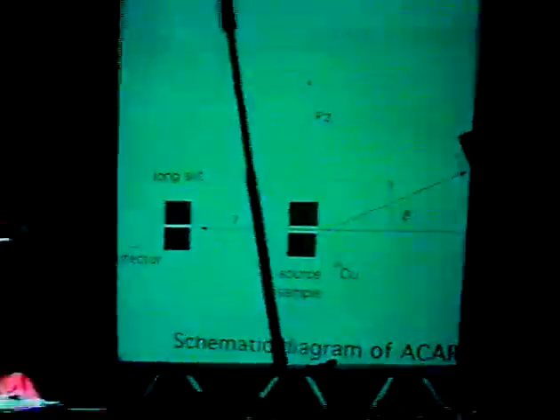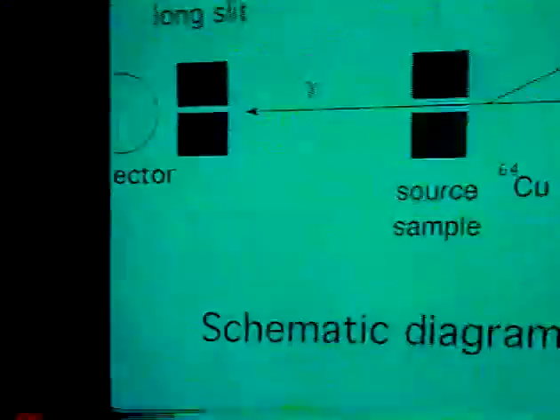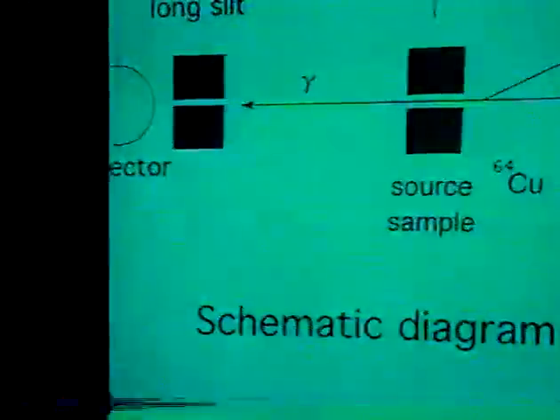Average lifetime is 125 picoseconds. The positron annihilation is measured by angular correlation of annihilation radiation and positron annihilation lifetime spectrum.